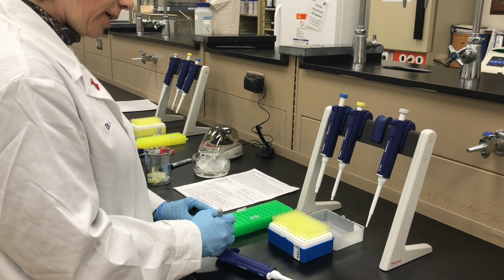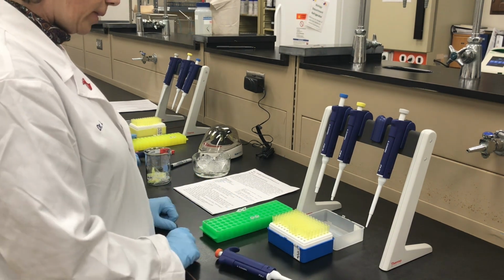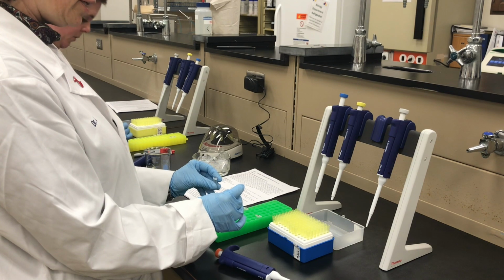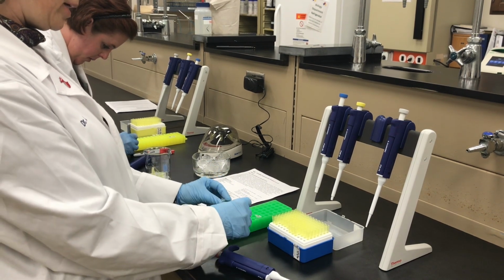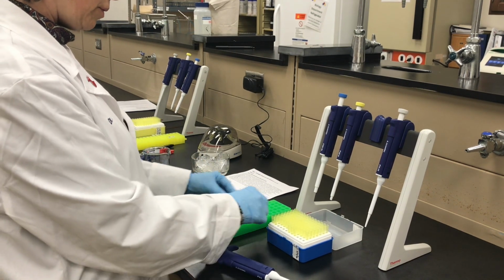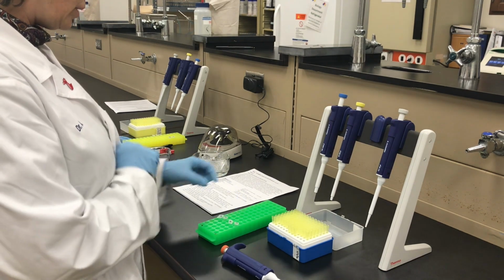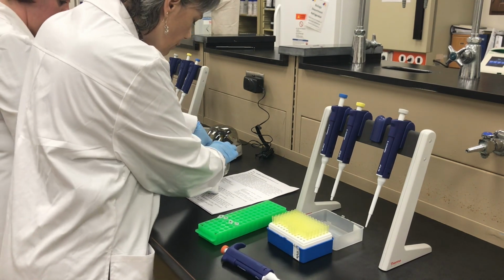I'm going to record in my notes which is which, because 2 tubes are going to get patient samples. The patient samples are letters A, B, C, and D. Dr. Cheney has A and B. I've got C and D. The other 2 tubes are going to get controls. I have a positive and a negative, a P and an N, and so does Dr. Cheney.